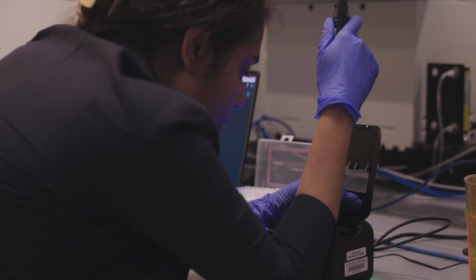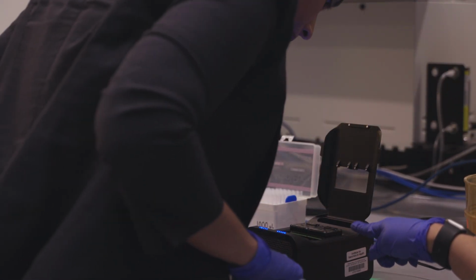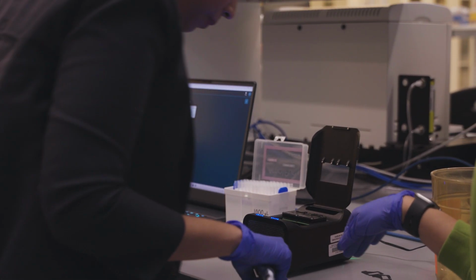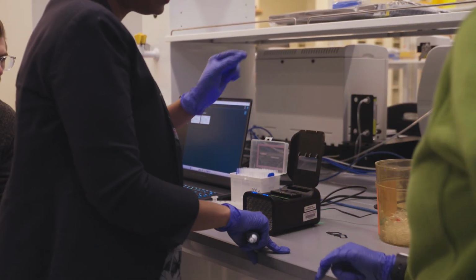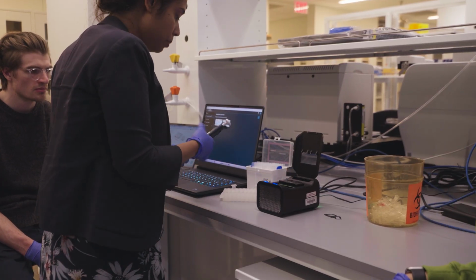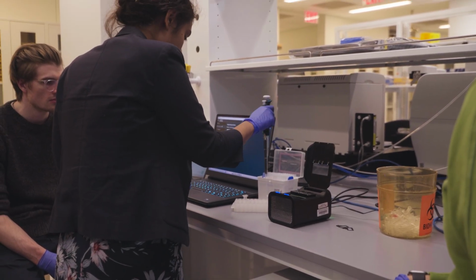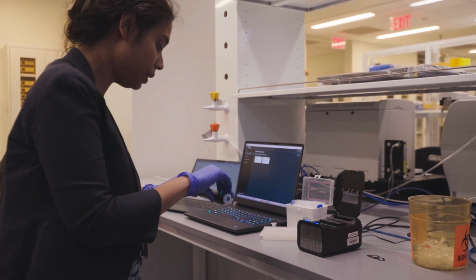And see now, a few microliters left, right? That should be enough. Just take it out. Even if there is a drop, that's fine. So 5 minutes incubation they suggest, even if it is a little bit longer, that is fine. After 5 minutes, again 500. Okay, so we are gonna do it 2 times.